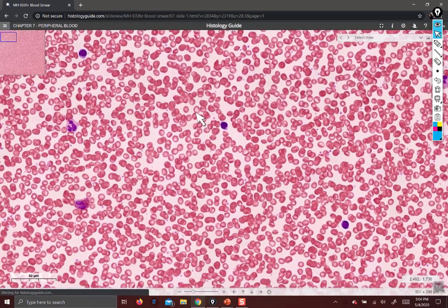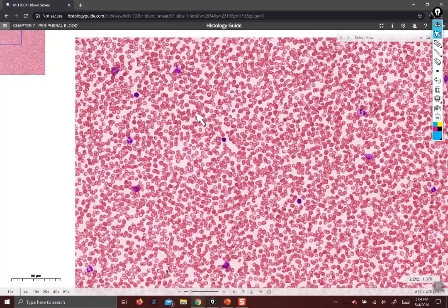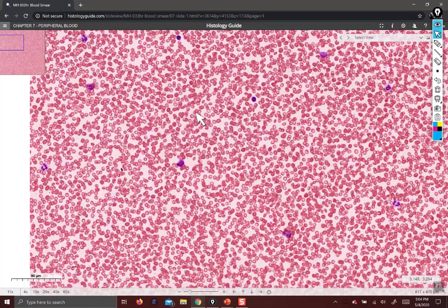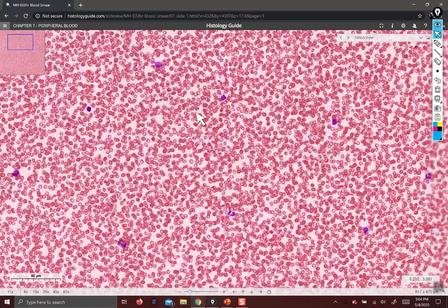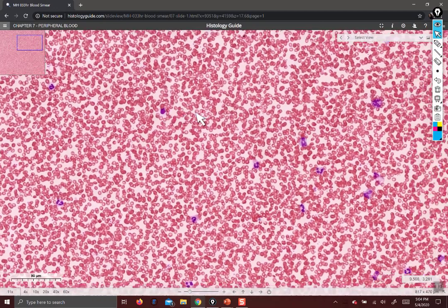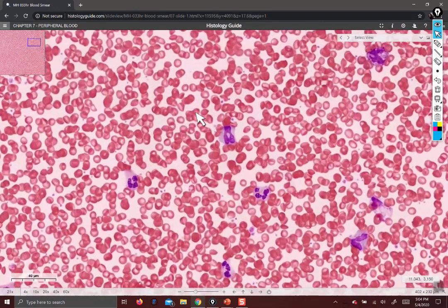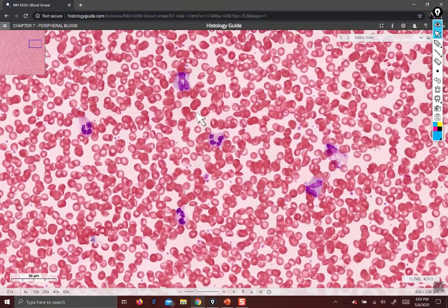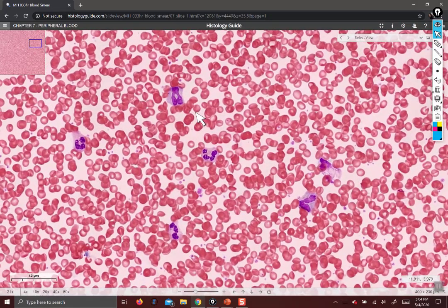We've found everything but a monocyte. To save ourselves some time, I'm going to hunt around. If you pay close attention while I'm scanning, most of the cells are unsurprisingly neutrophils. I found a monocyte — in fact I found two right near each other. You can estimate them by how large they are: not only do they lack granules, but they're very large — you could probably fit three or four erythrocytes in there. That's a good indicator you're looking at a monocyte.